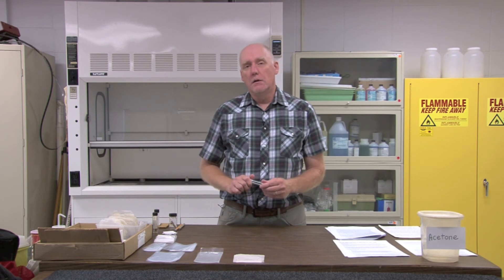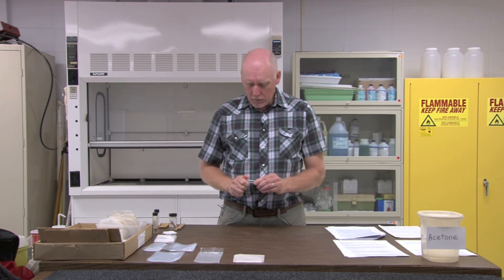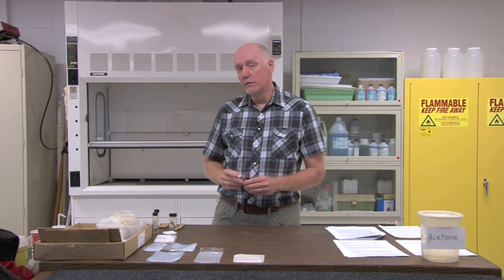Exuvia can be stored in shell vials with a slightly weaker alcohol solution, down to about 50%. I generally store all of my specimens in 80% alcohol because I don't want to confuse the two and accidentally put 50% alcohol into a nymph vial. But you can use a weaker solution with exuvia.